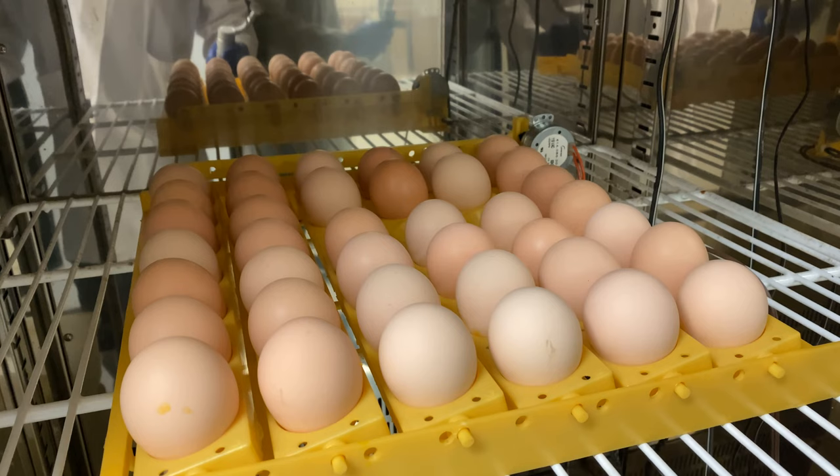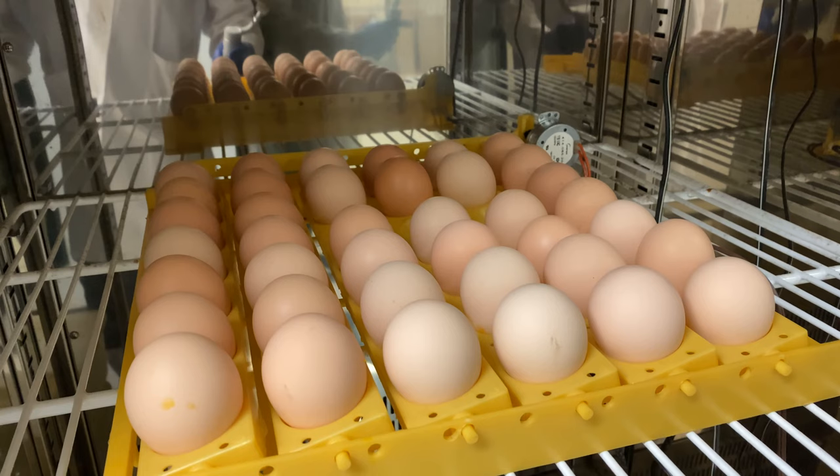The eggs are placed in these trays and this gently rocks the egg back and forth. I was hoping to capture the motion in this video; however, the rocker moves very slowly.